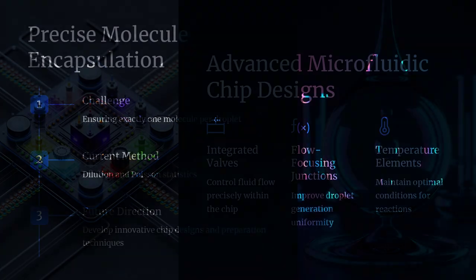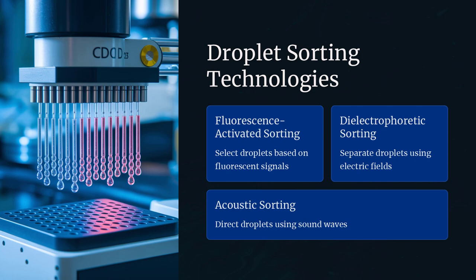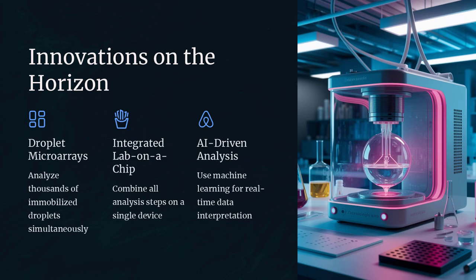Furthermore, the integration of microdroplet-based single-molecule analysis with lab-on-a-chip technologies is paving the way for new diagnostic platforms that are both sensitive and portable. For example, microdroplet systems can be used to perform digital PCR, polymerase chain reaction, at the single molecule level, enabling the detection of rare genetic mutations in a patient's blood sample. This could revolutionize personalized medicine by providing rapid, accurate diagnostics that guide targeted therapies. Imagine a handheld device that can perform thousands of individual molecular tests simultaneously, each in its own microdroplet, and deliver results in real time. This is the promise of single molecule analysis in microdroplet environments.